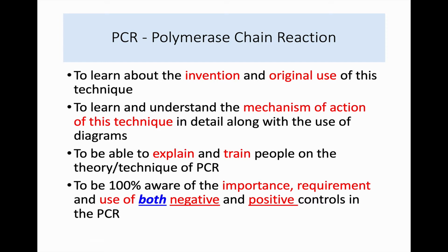So what I wanted to do here, if you look at this slide, is talk a little bit about how it was invented, its use, and its mechanism of action, so that you'd be able to explain and maybe train people on the technique. If you can explain it, it means you understand it. And I want you to be aware of controls, negative and positive controls, in this technique.